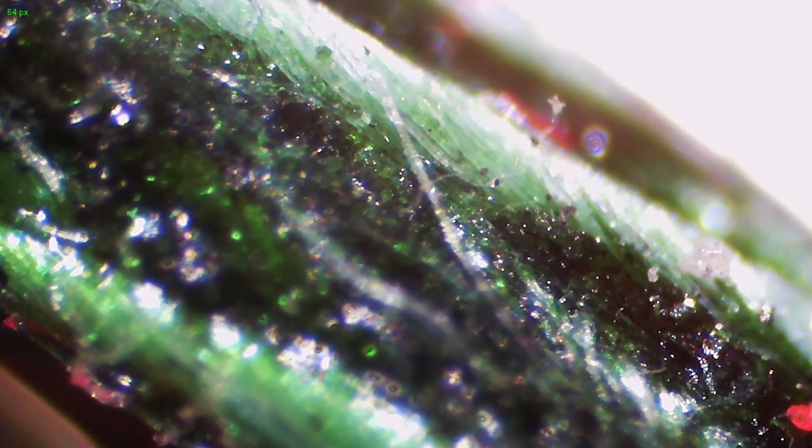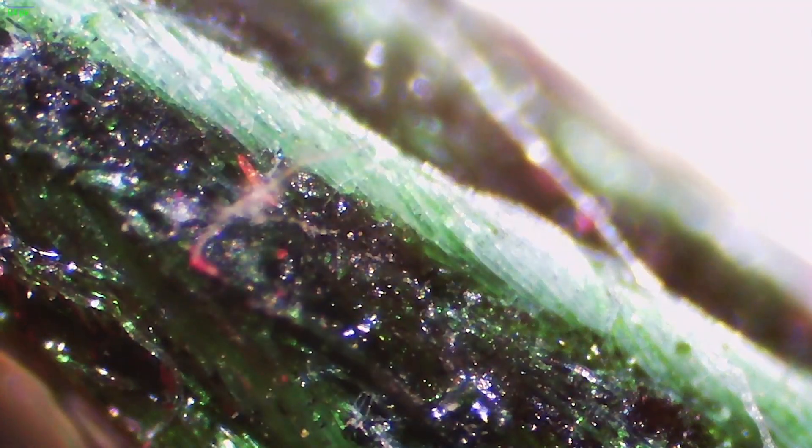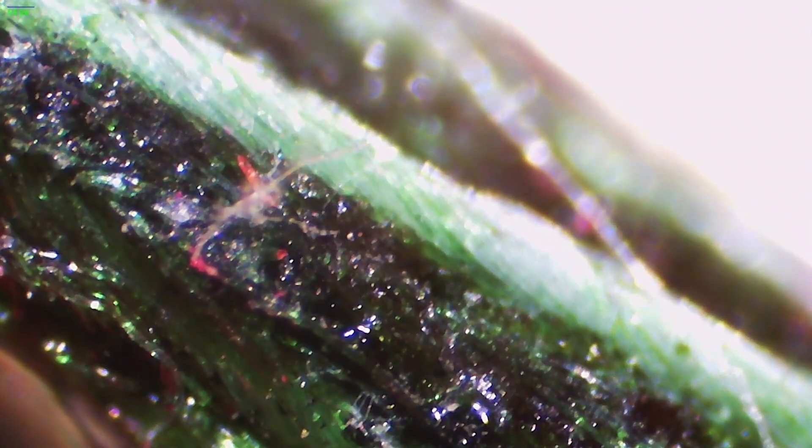To me it looks like green licorice, but we can't eat this one. I'm seeing all these little red fibers on here. My guess is they're either microplastics or little red wood shavings — this firework came with some bottle rockets with red sticks, so maybe those are little red wood pieces or microplastics.